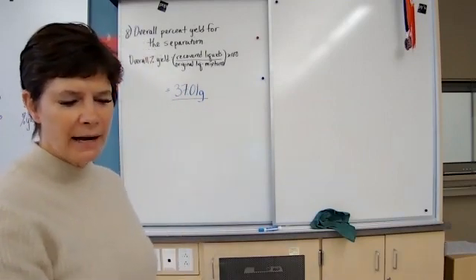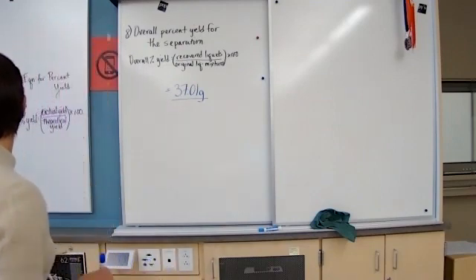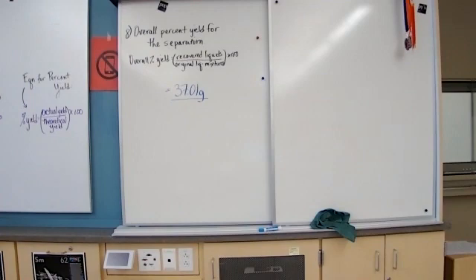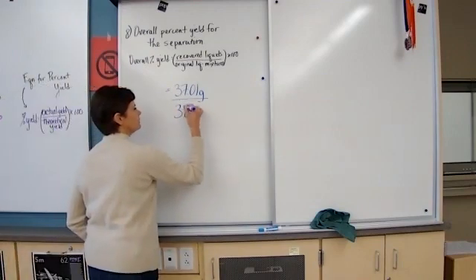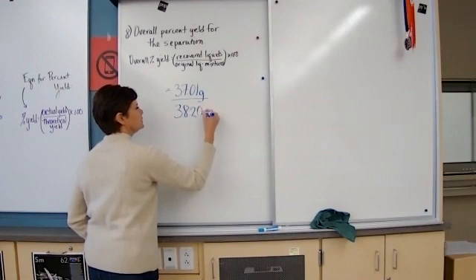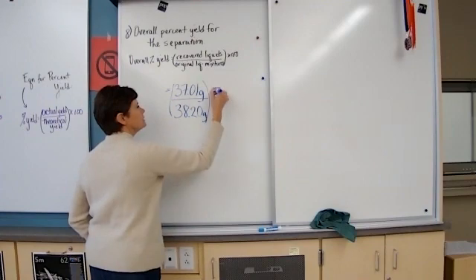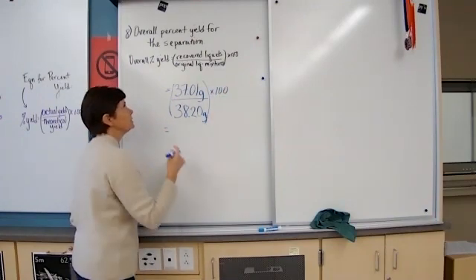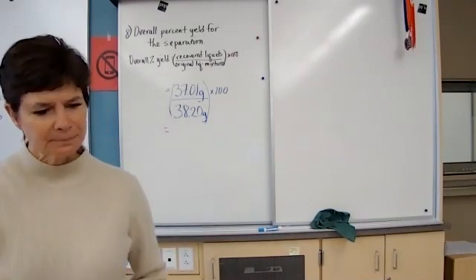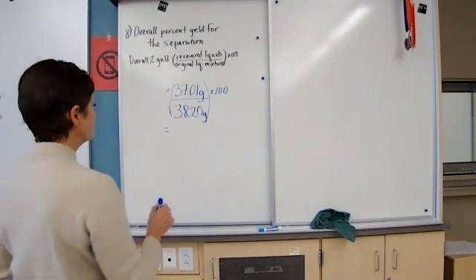We're going to divide that by our original total mass, which was a mass of 38.20 grams, if you look back at what we were working with before. This was the total original mixture mass. We're going to divide and then take that times 100 to get an overall percent yield. In this case, that's a 96.9% yield.